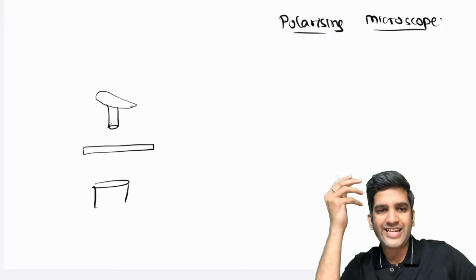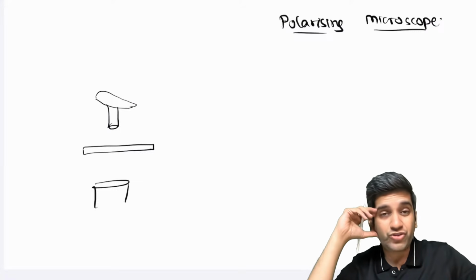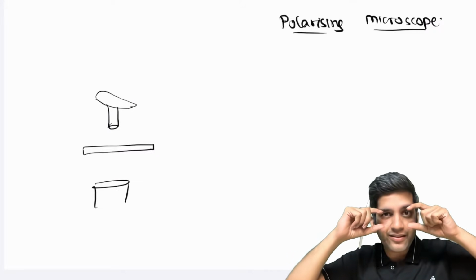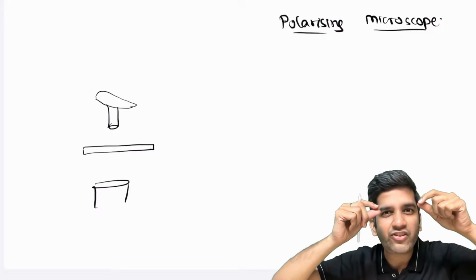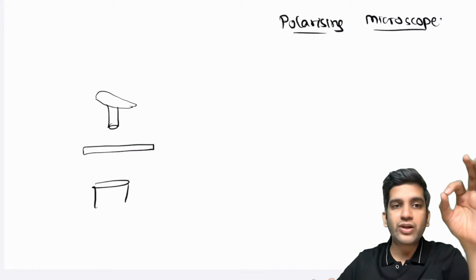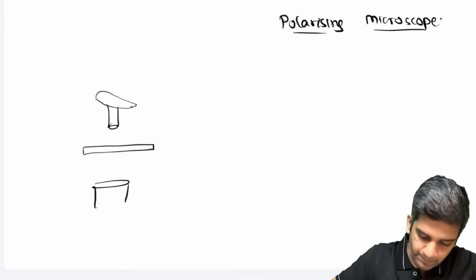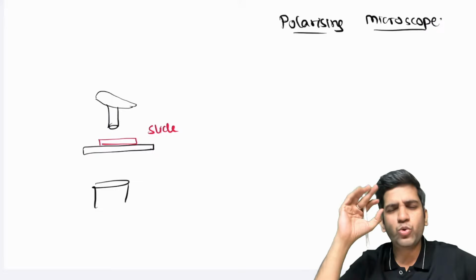Polarizing is a feature of light. That's all. Simple, normal feature of light. If you have been to 3D movies, you take the glasses out, put them in, take them out, put them in. You'll see different colors because a 3D glass is a polarizer. If you have 3D glasses at home, let's say you have a simple normal slide here, right? Try this out. It's a beautiful polarizer.